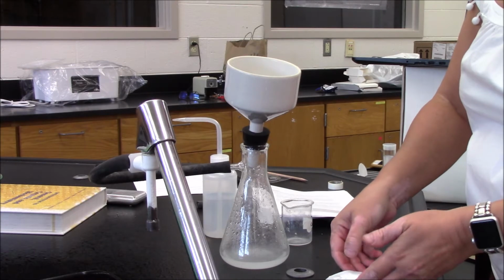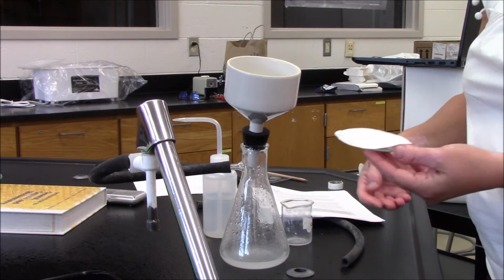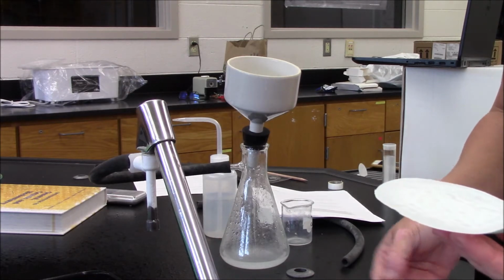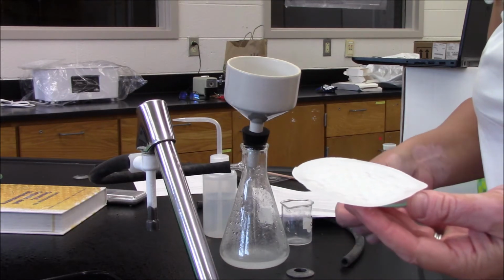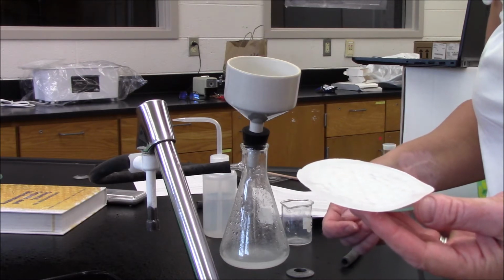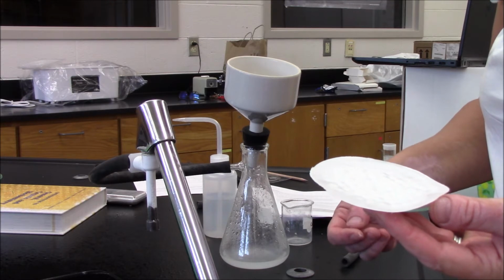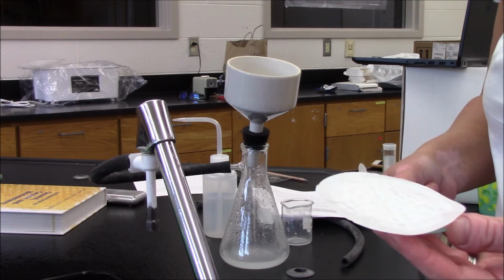I'm going to put it on my watch glass and go ahead and dry it in the oven. What would happen right now is that I would dry it, let it go for 15 minutes, weigh it, let it go for 15 minutes, weigh it again, and my goal is to get to a constant mass.